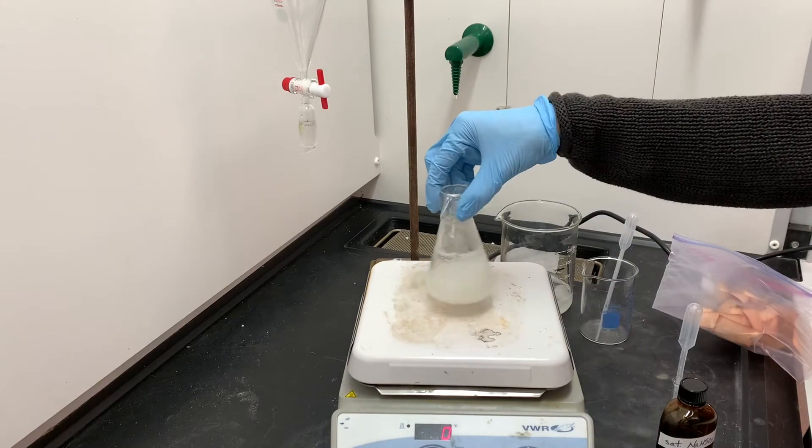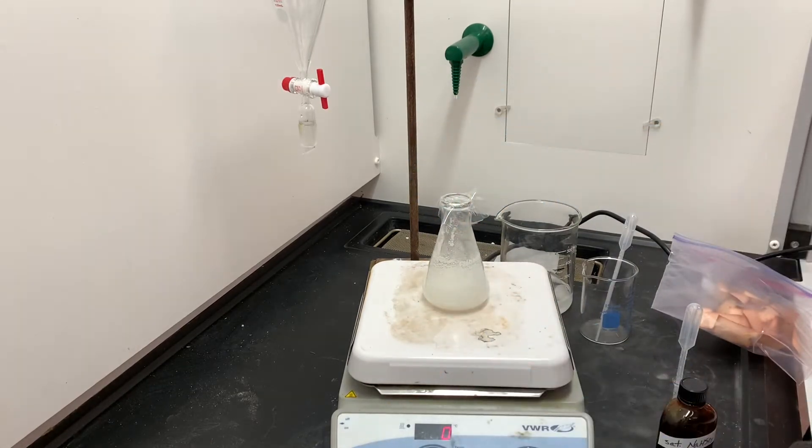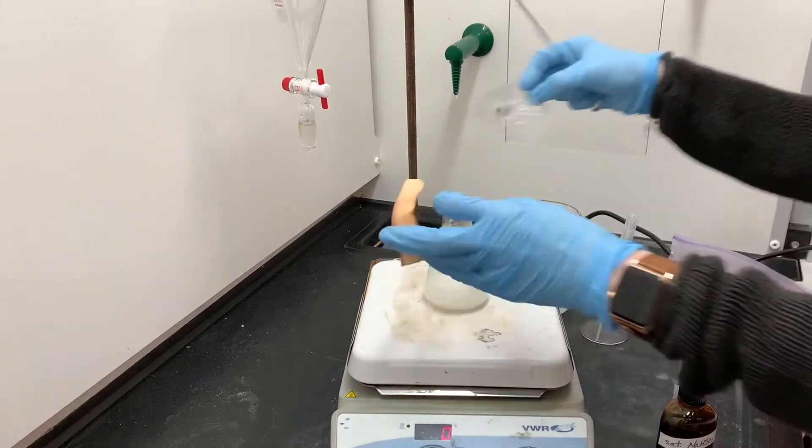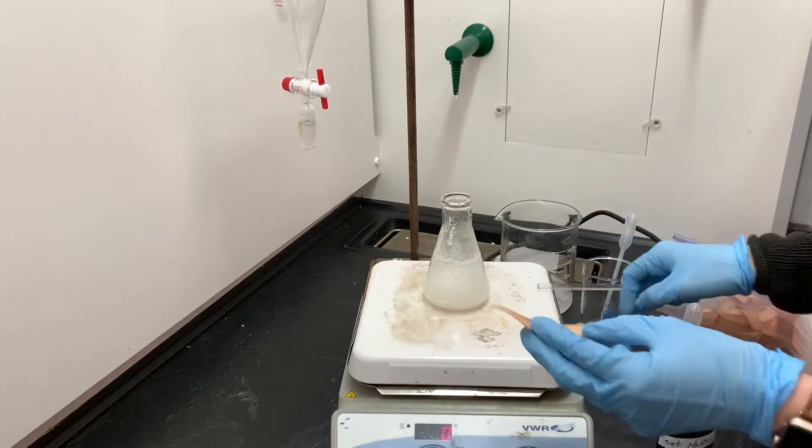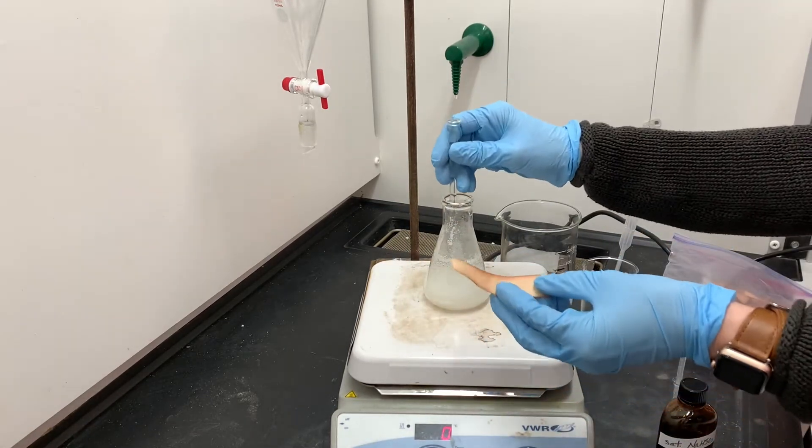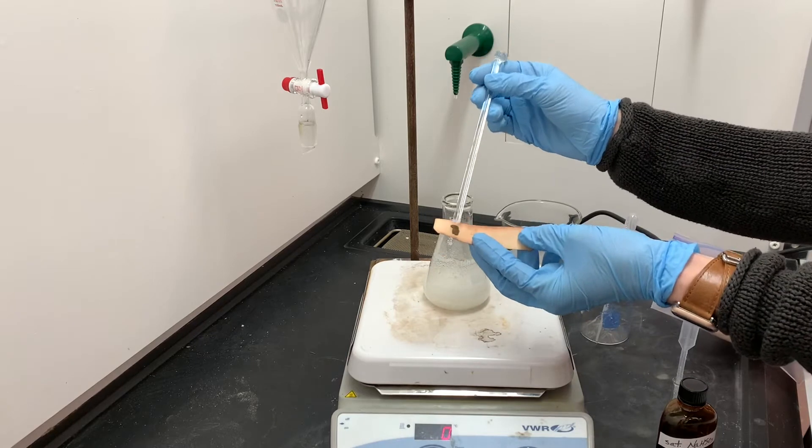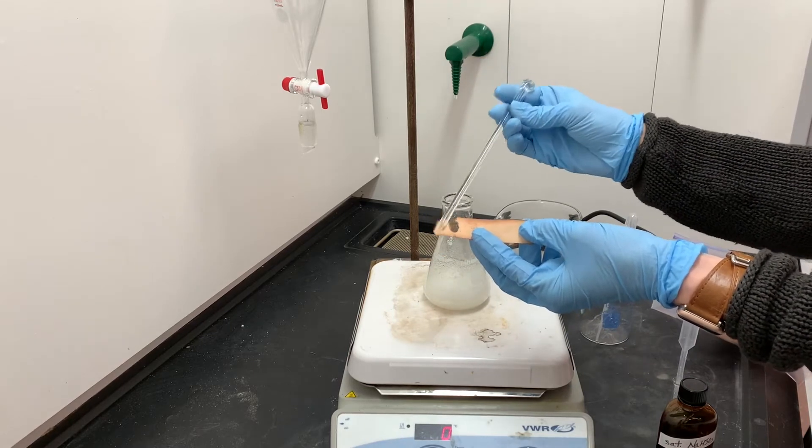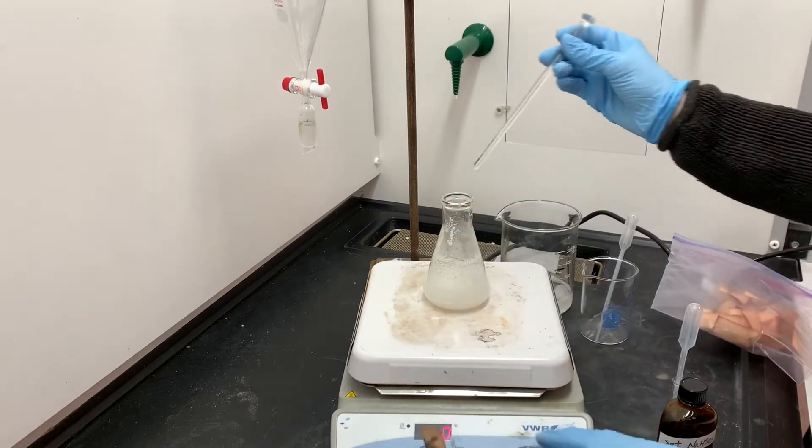It's the end of our 30-minute reaction period. We're going to do one final starch iodide test. This time however, we are testing to make sure that we have reacted all of the bleach. We do not want any bleach present, which means that we do not want this blue color that we're getting on the starch iodide paper.